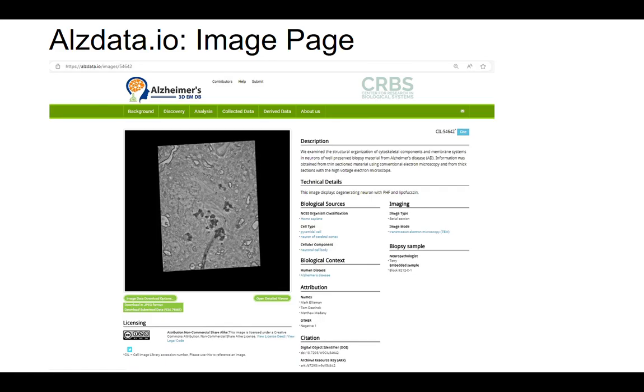Each image we produce is carefully stored with detailed metadata, which is essential for comparing results across various experiments, subject preparations, imaging techniques, and biopsy sources. The metadata ensures that the context of each image is fully documented, making it easier to understand the nuances of each dataset.